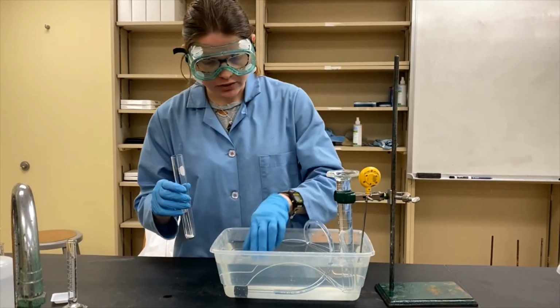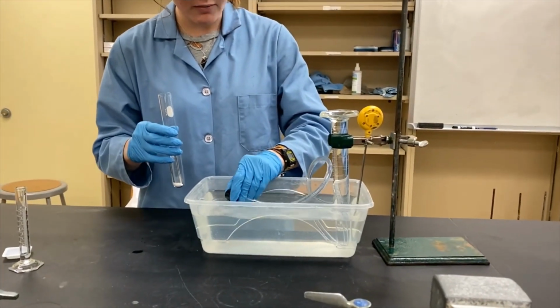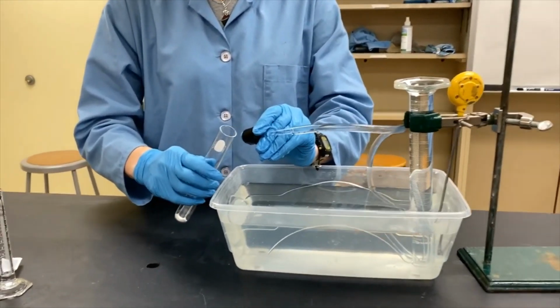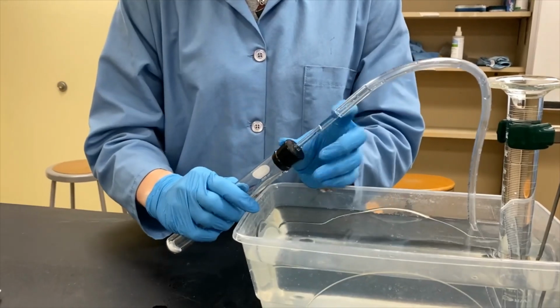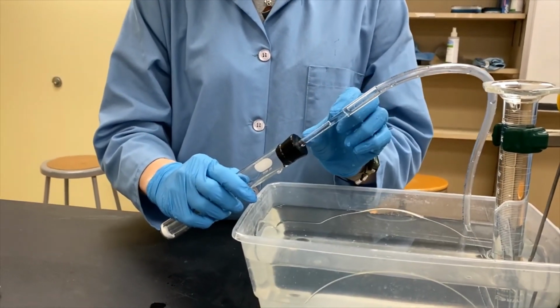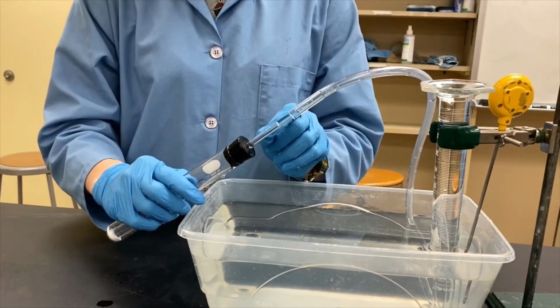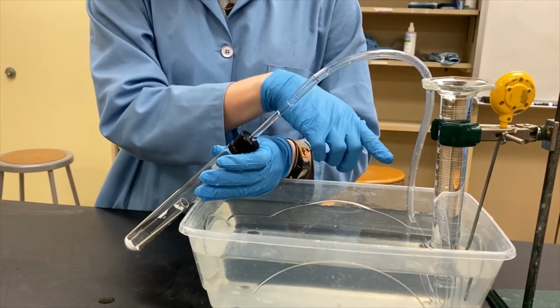So what I'm going to do is carefully remove the top of this tube here. I've capped it with my thumb and I'm going to try to quickly attach the tube at an angle so the least amount of air gets into the system. So we have a small air bubble here. That's okay, but we want to note that that's happening in trial 1 for our error when we calculate that later, because that is gas that we have not created, but it will be accounted for in the volume.